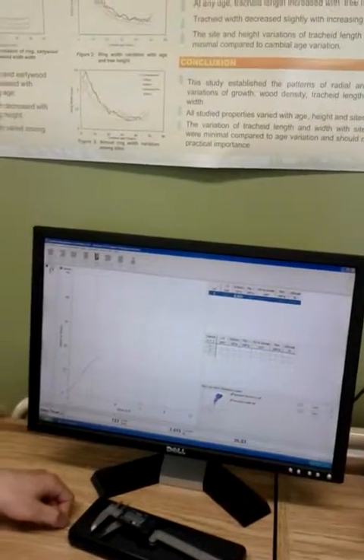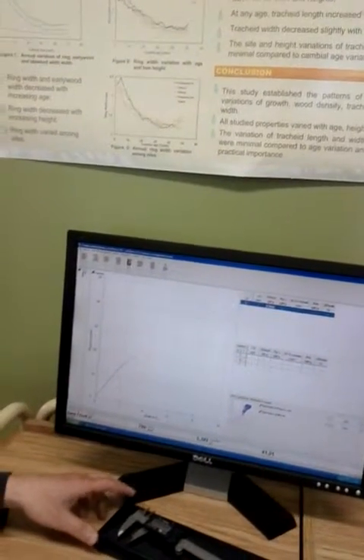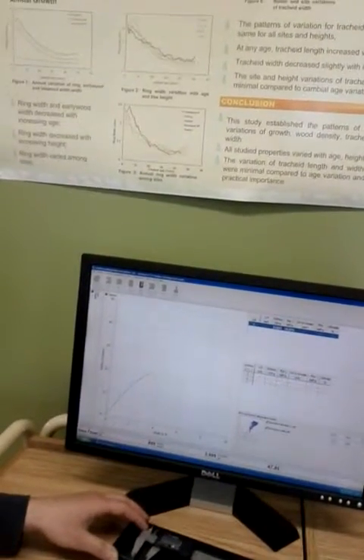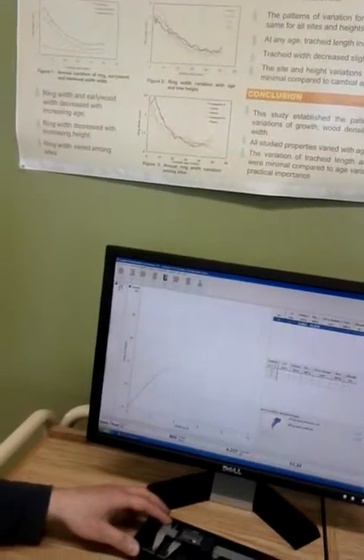With WPC 5, it's usually good, but with higher wood content, 5 it's too quick. It depends on the material. We get the maximum at about close to it.